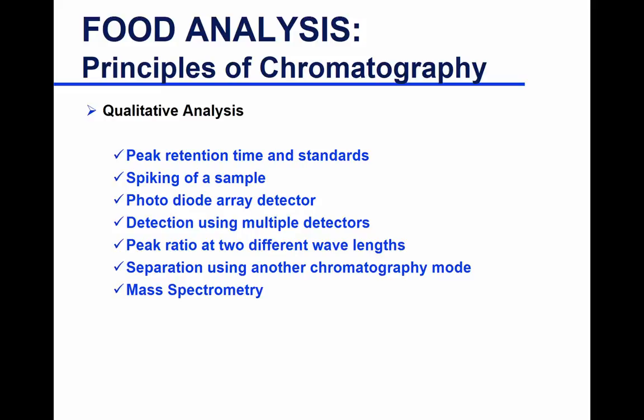Photodiode array detector, I'll talk about it a little bit more when we cover HPLC, but this detector allows generation of a fingerprint of absorbance. So oftentimes this helps a lot with identification. Sometimes it has its own limitation as well, but the photodiode array detector gives you a spectra. Here you have your absorbance, and here you have wavelength, lambda. And the unit is nanometer.